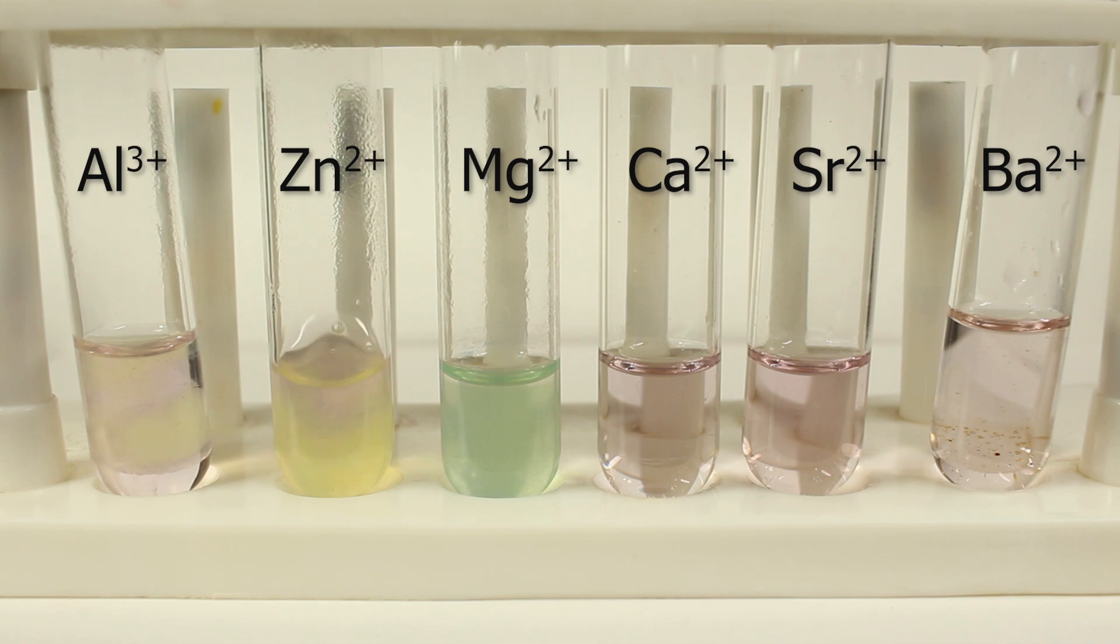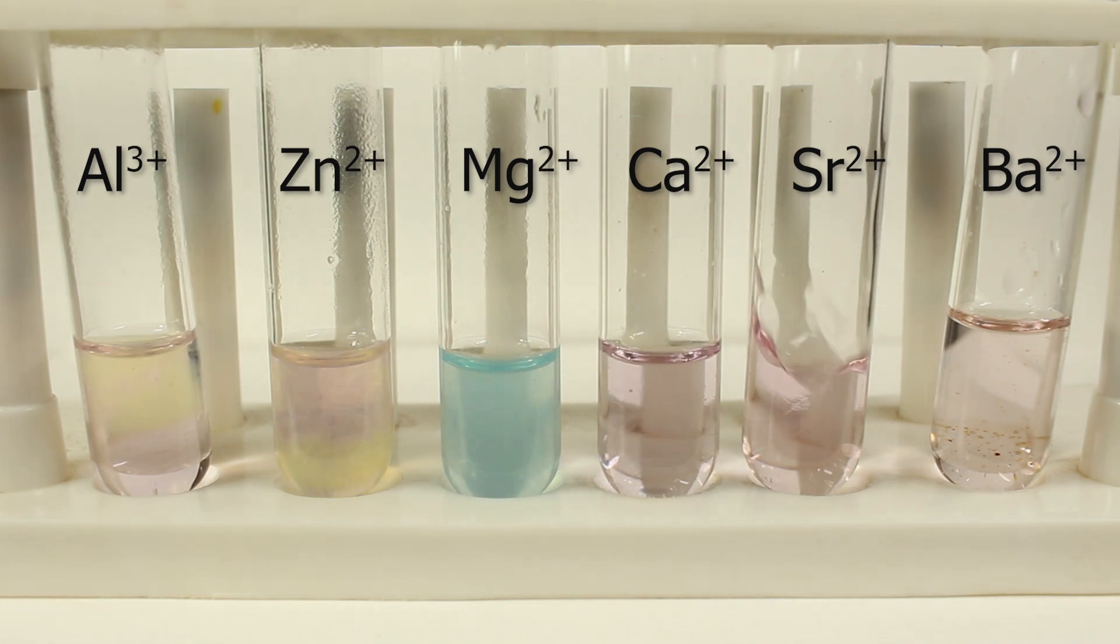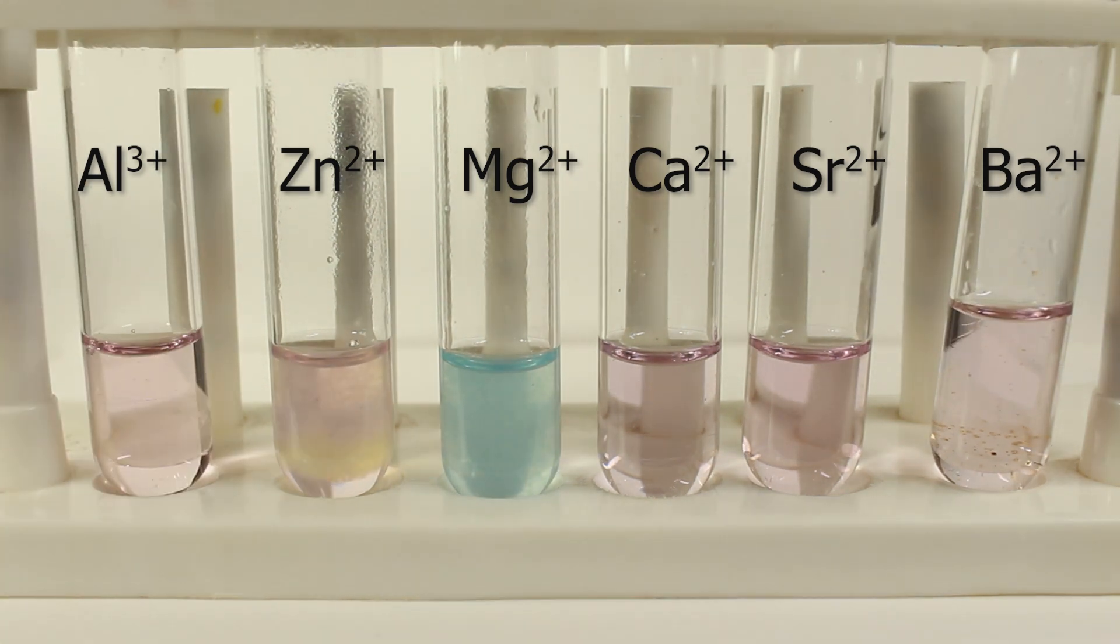You can see that it really returns violet back in aluminum and zinc case. No change is expected in calcium, strontium, barium. Magnesium which had a greenish tinge before now is clearly blue.